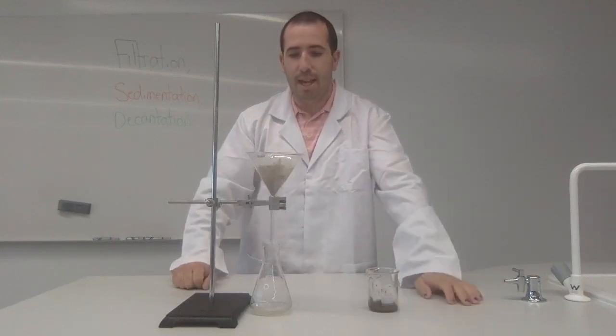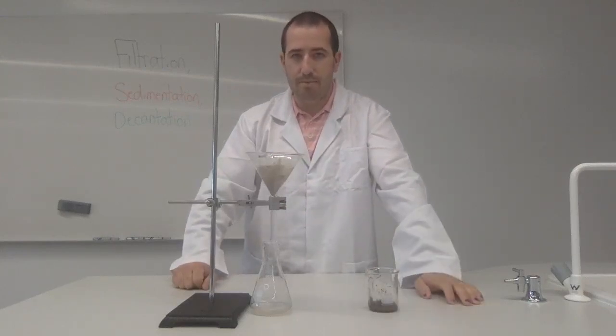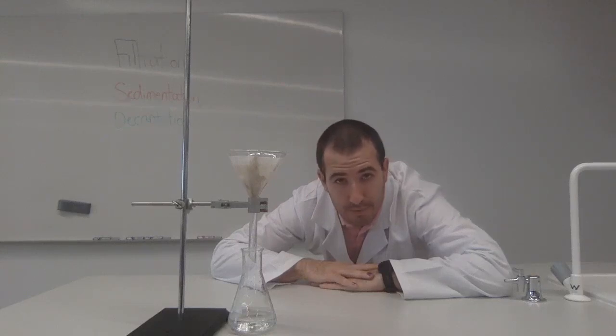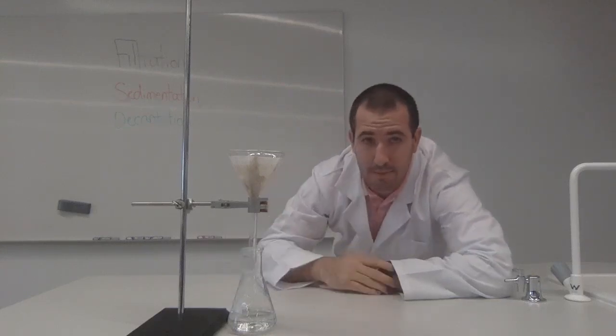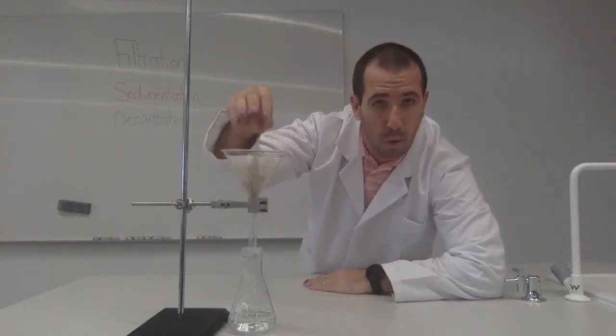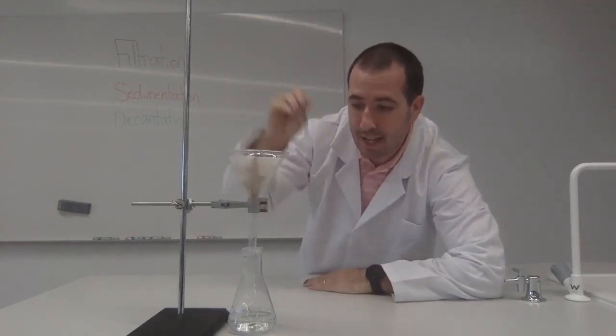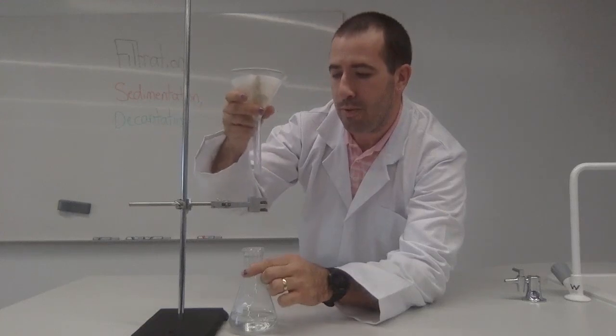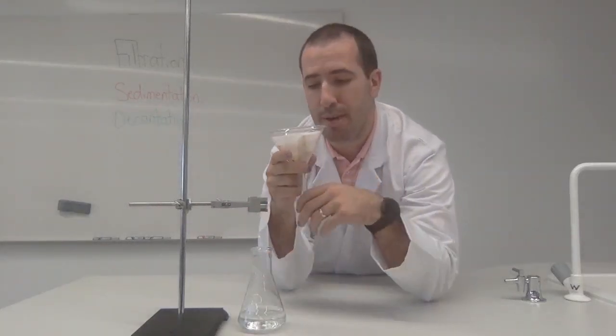Now, let's fast forward to see how we look at the very end. And here we are. As I said, we'll fast forward through a little bit and get to the end result. And this is what we've got. So let's have a look at what is left in our filter paper or the yucky particles that are left. And let's look at our nice clean water we've got down the bottom. So let's see the two. So let's start with what we've got left in the filter paper.